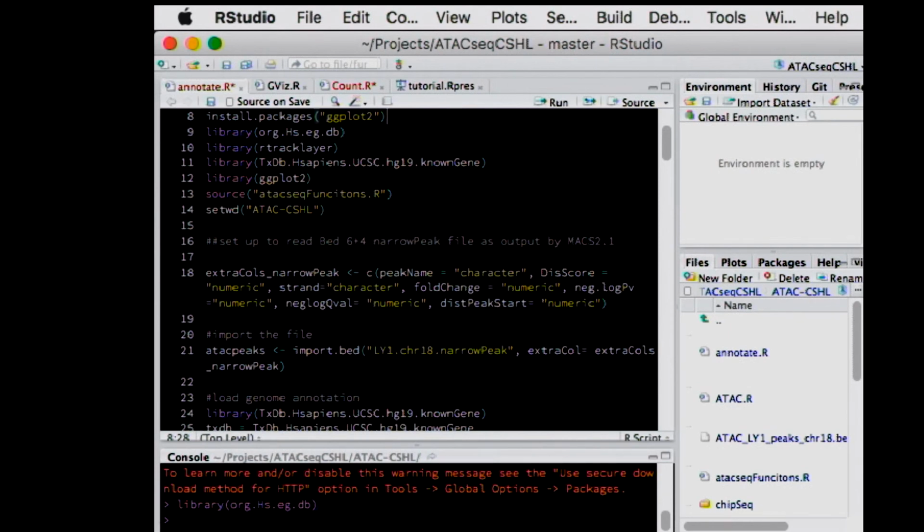So let's say we're going to get a bunch of ATAC-seq data, right? Are we good? Cool. So what does ATAC-seq data tell us? Like, what questions can we ask? Remember? Open chromatin? Yeah.